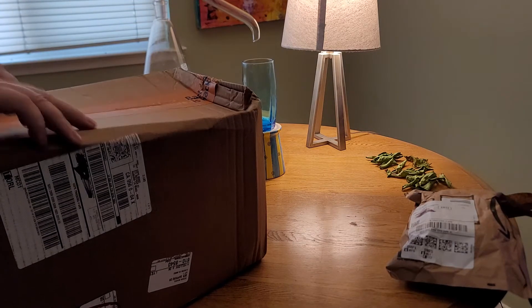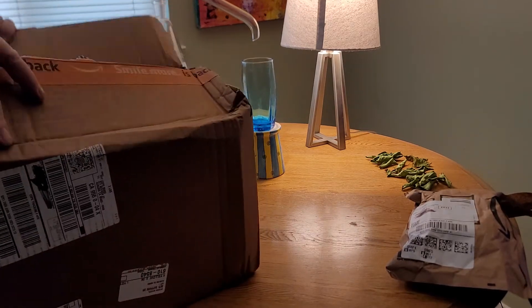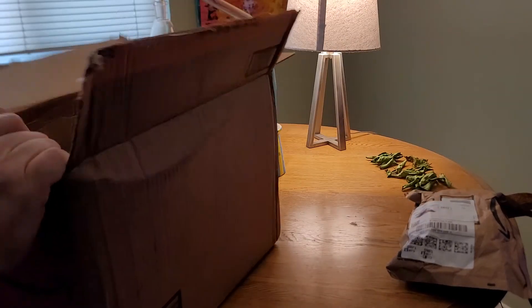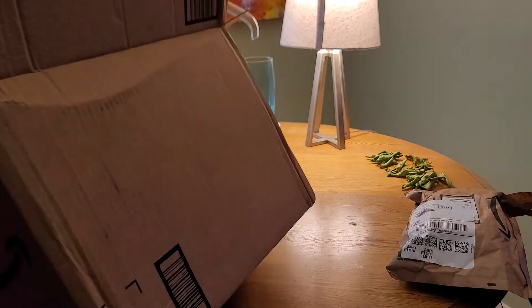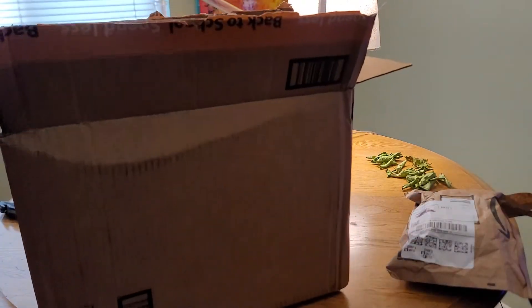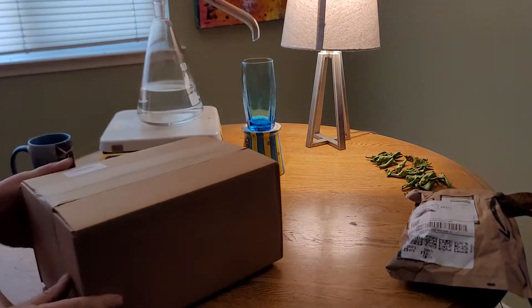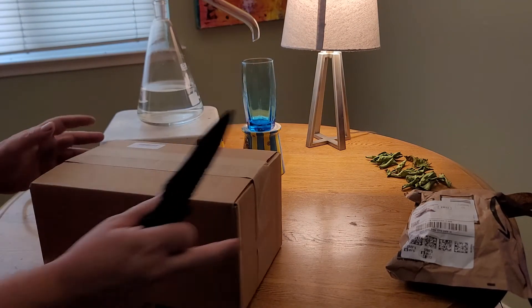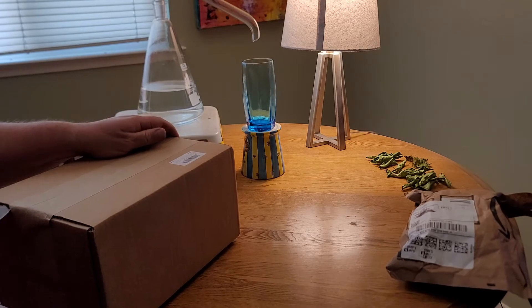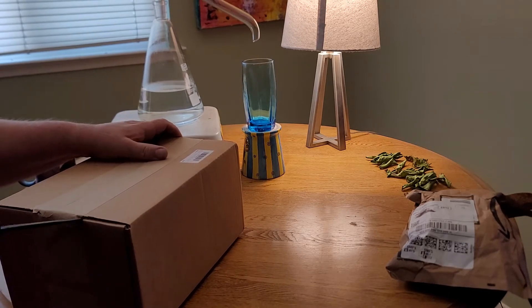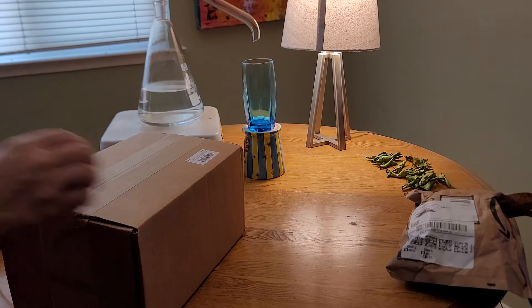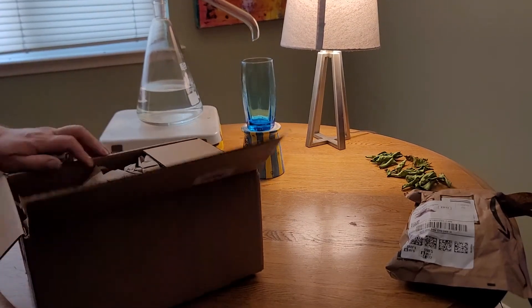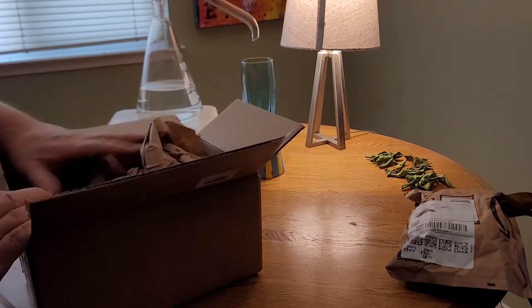This is going to be for upcoming alchemy experiments that I want to do on YouTube. It's a box within a box. At least they packaged it well. It doesn't appear to be broken.